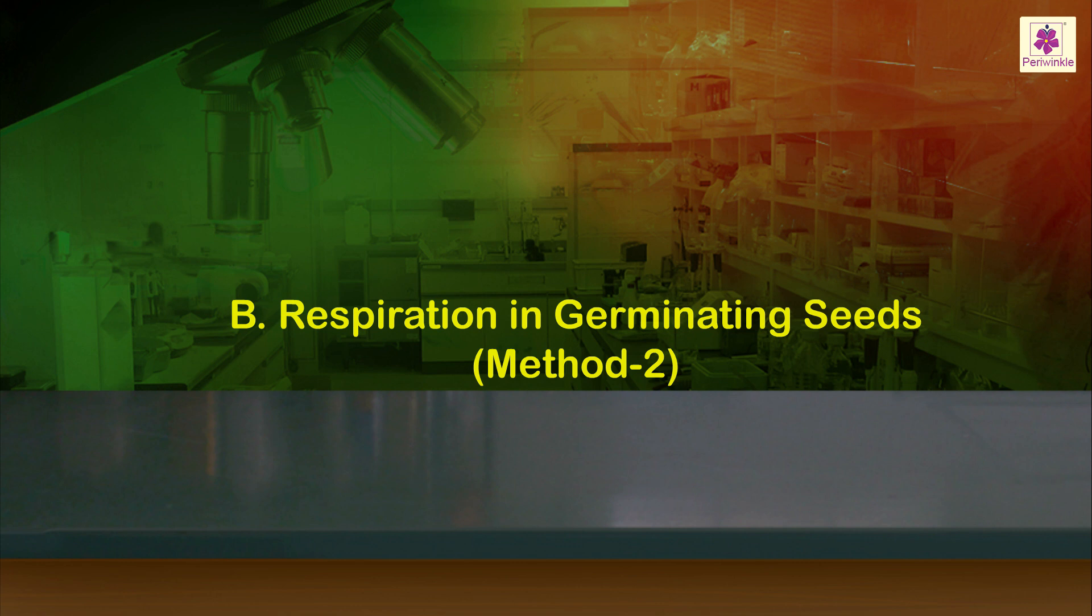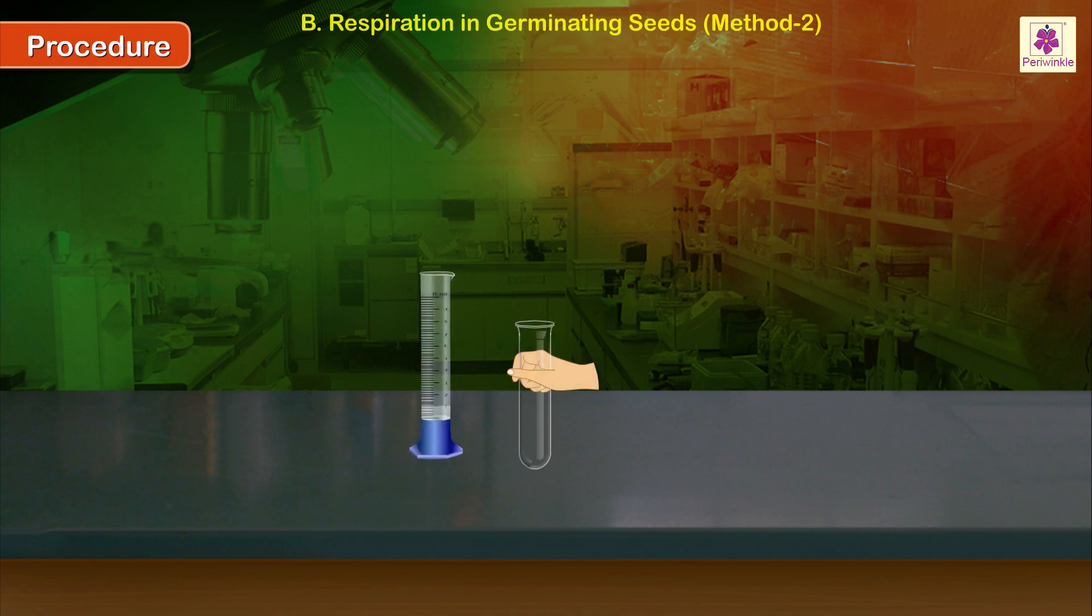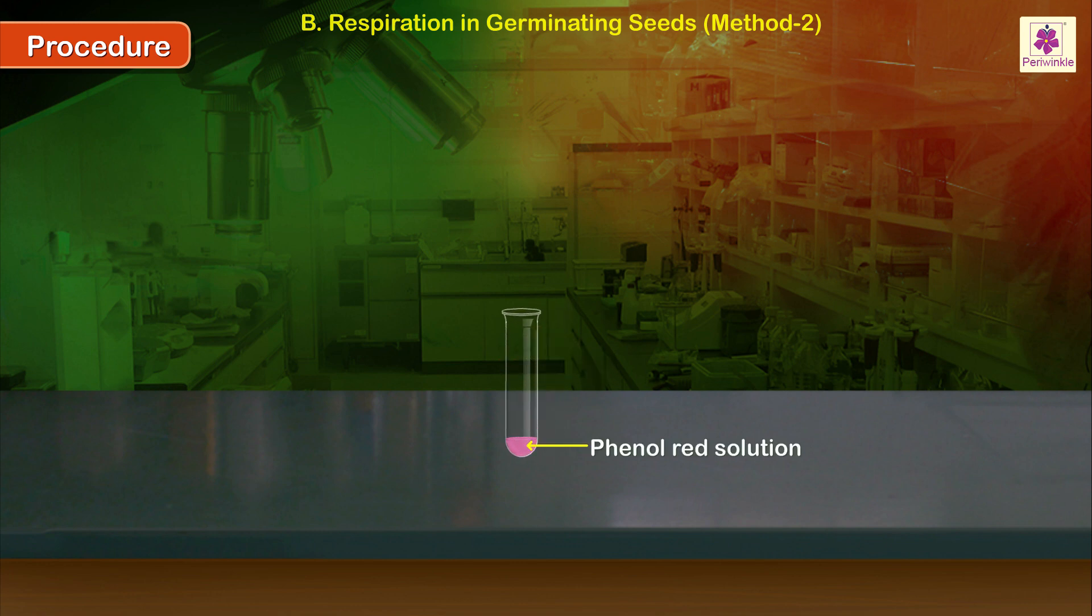Respiration in germinating seeds, Method 2. Procedure: Take 1 ml water in a test tube. Add two drops of phenol red indicator to it and shake. Observe and note the color of the solution.